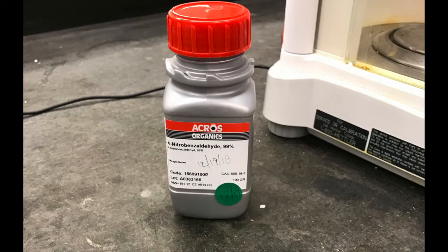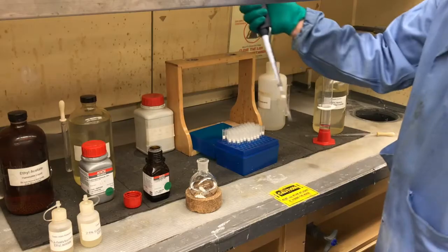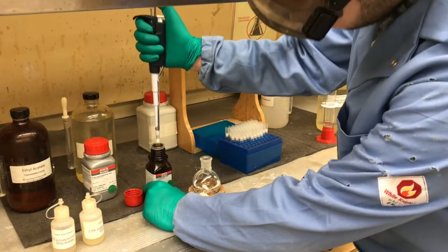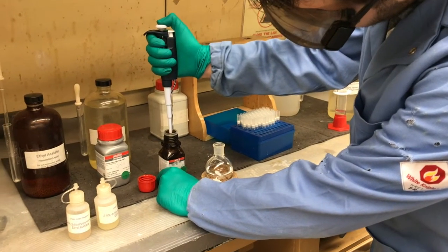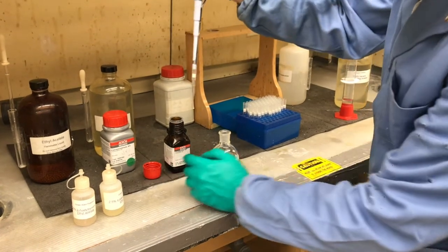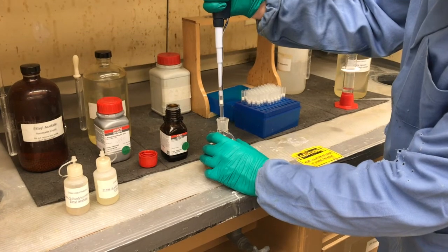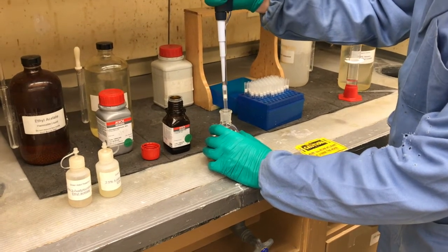Once again, for the room temperature reaction, we started out by weighing out p-nitrobenzaldehyde. Here's how much we weighed out. Then we added the 2-acetylpyridine to a round bottom flask that already had the deionized water. We added 0.448 milliliters once again, just like the elevated temperature reaction.